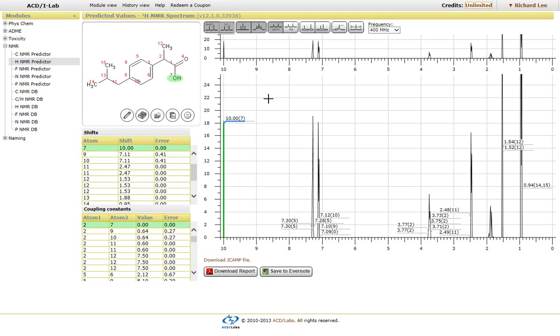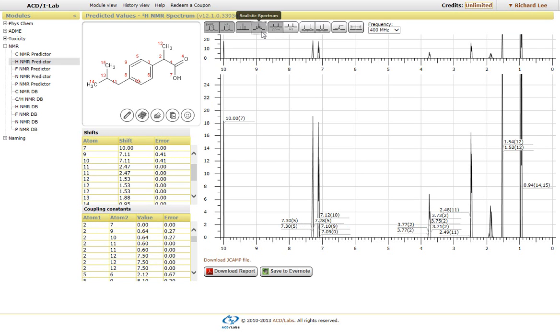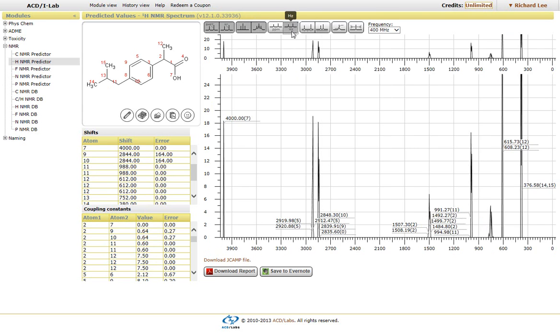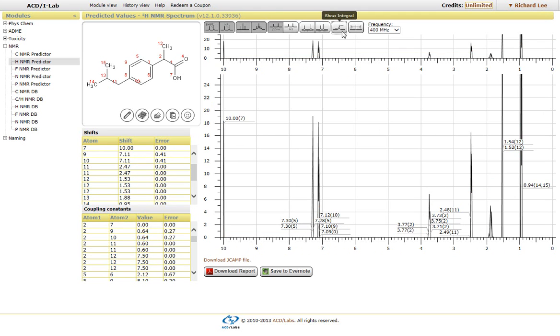as you can see, you have the ability to turn on or off the splitting. You also have the ability to switch the scale, zoom in and out or look at the integrals as well.